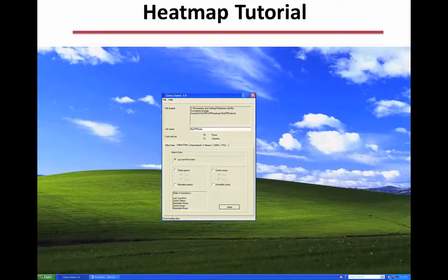And in the case of KD data, I like to go to the Adjust Data tab and log transform the file so that the colors on the heat map will appear with a greater difference than they would if you don't log transform it.